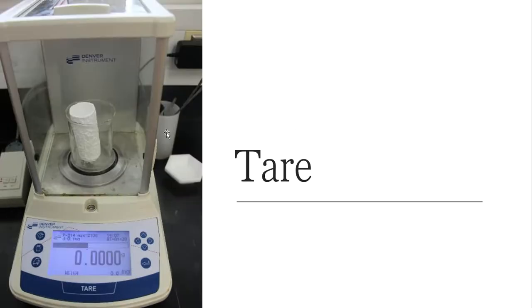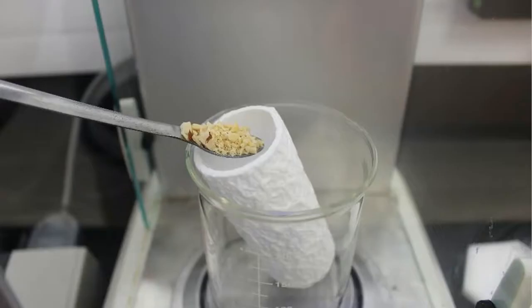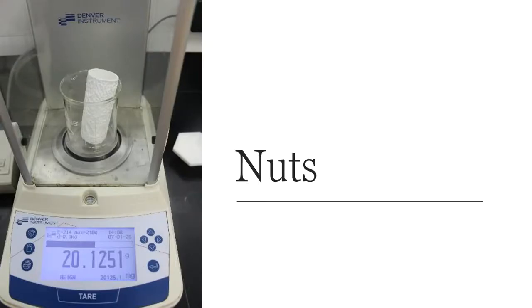All right, so now I'm going to tare out the thimble. I've just put it into a beaker so that it can hold it upright. So I've tared out the beaker weight and the thimble weight, and I decided to add some of those dried nuts into the thimble. How much? Well, I added 20.125 grams worth of nuts into that thimble.